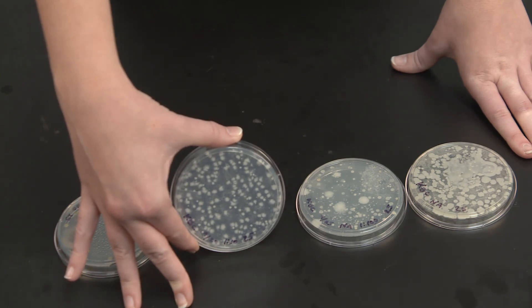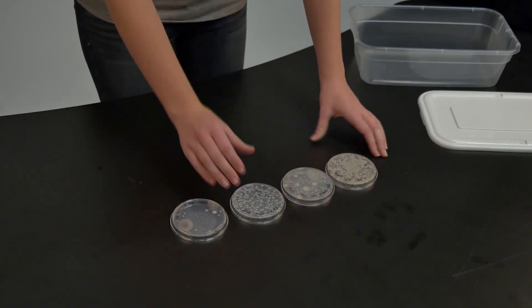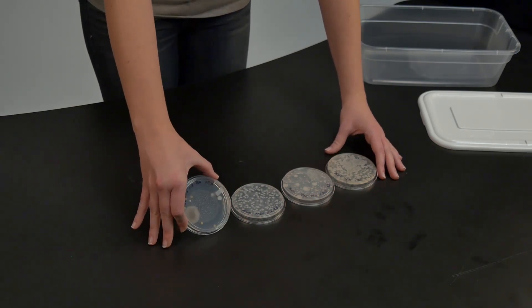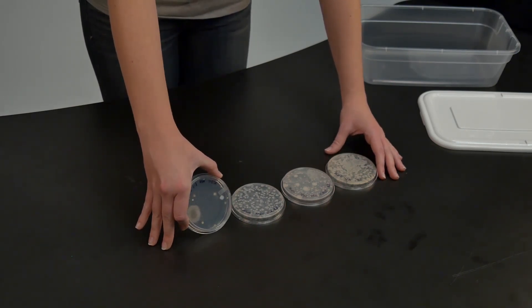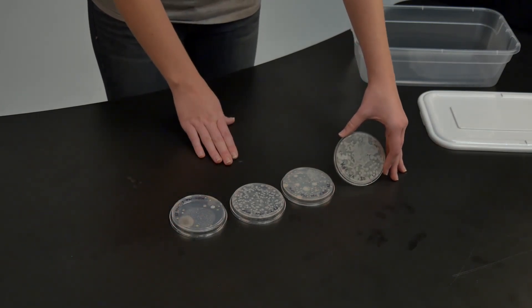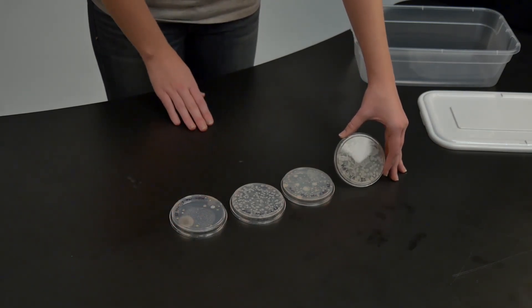The reason why we use a range of 30 to 300 bacterial colonies is because if there are fewer than 30, then sampling error can dramatically affect your results, whereas 300 is such a high number that it becomes difficult to accurately count every single bacterial colony growing on the petri dish.